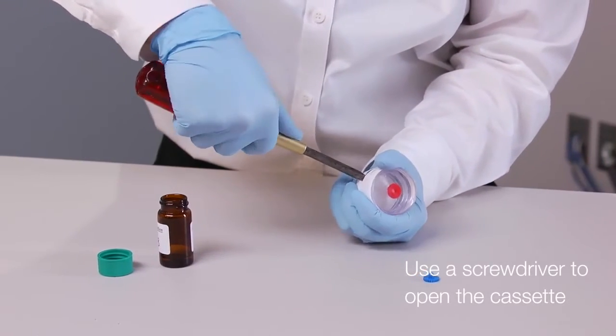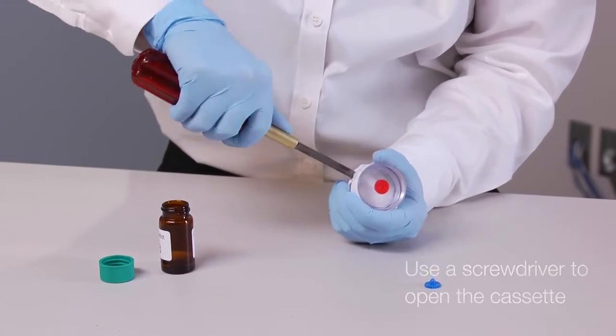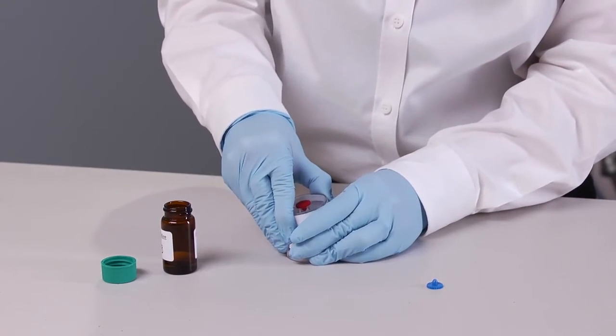Using a screwdriver or a coin, open the plastic cassette and separate the bottom piece that contains the filter and support pad.